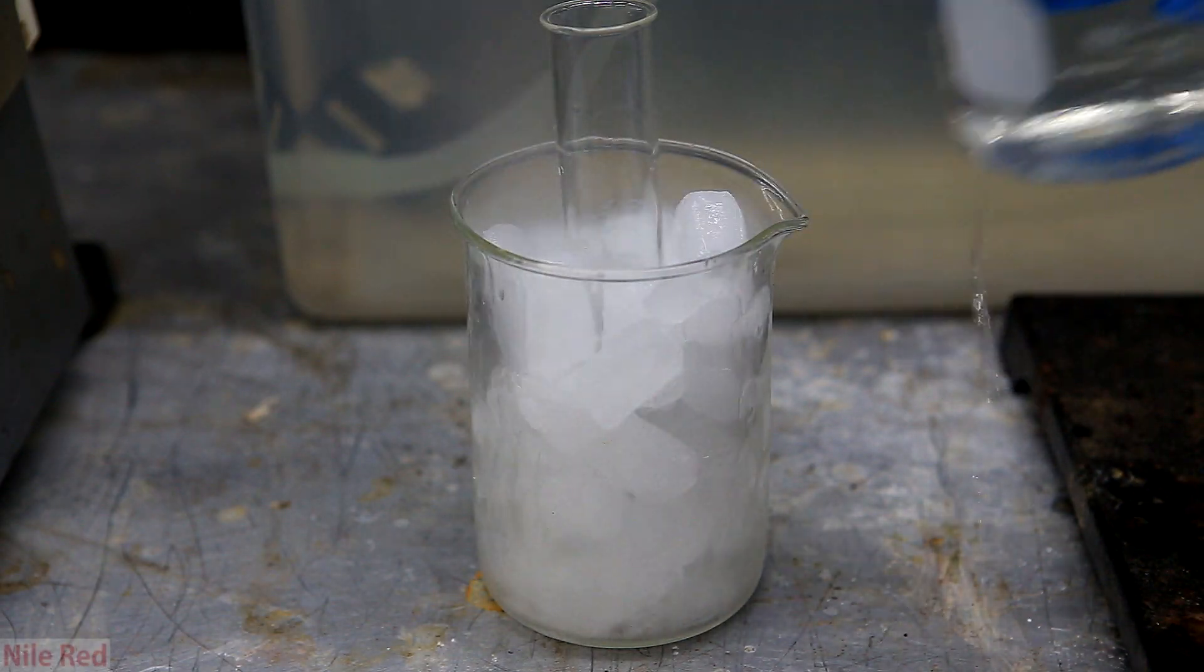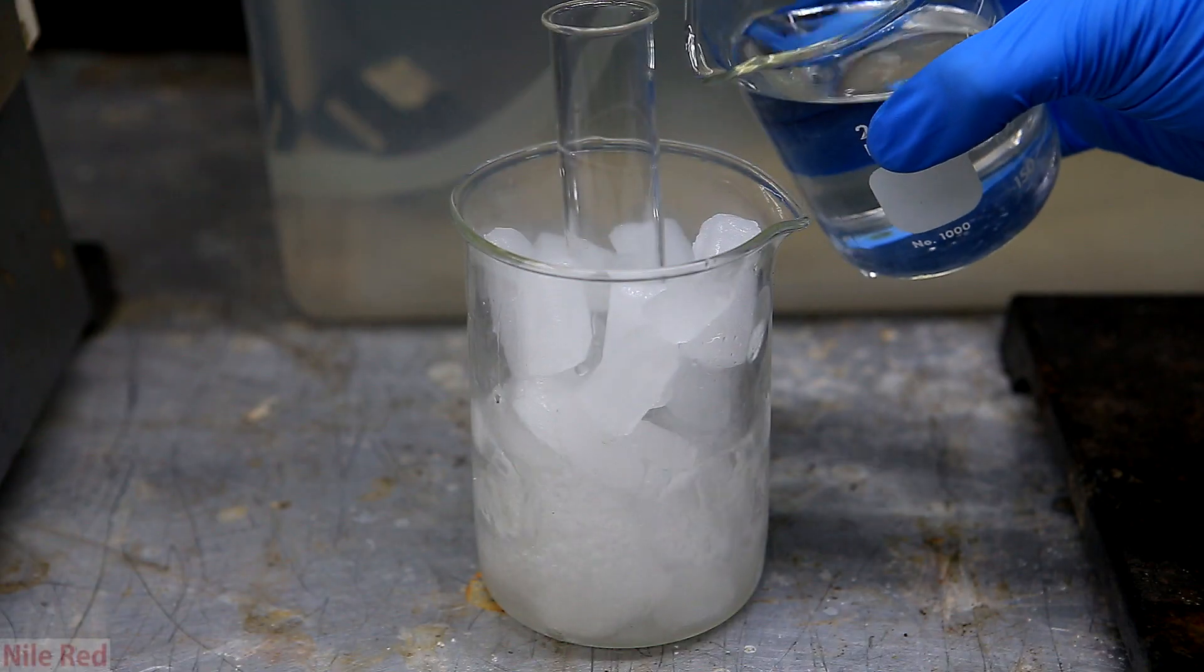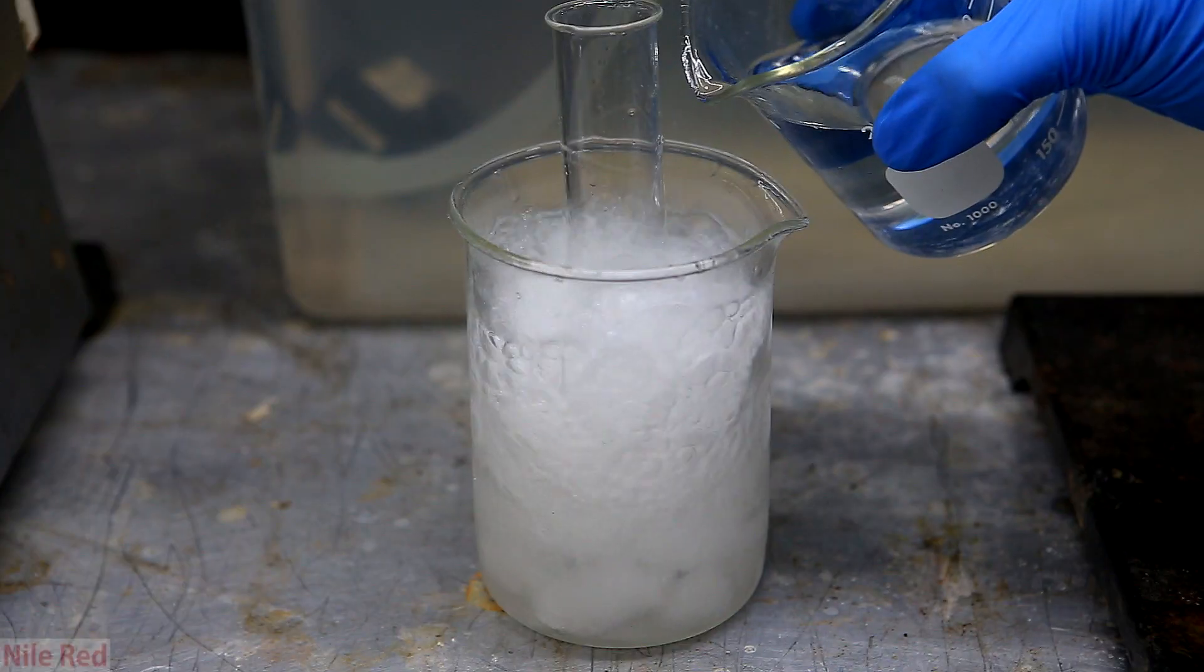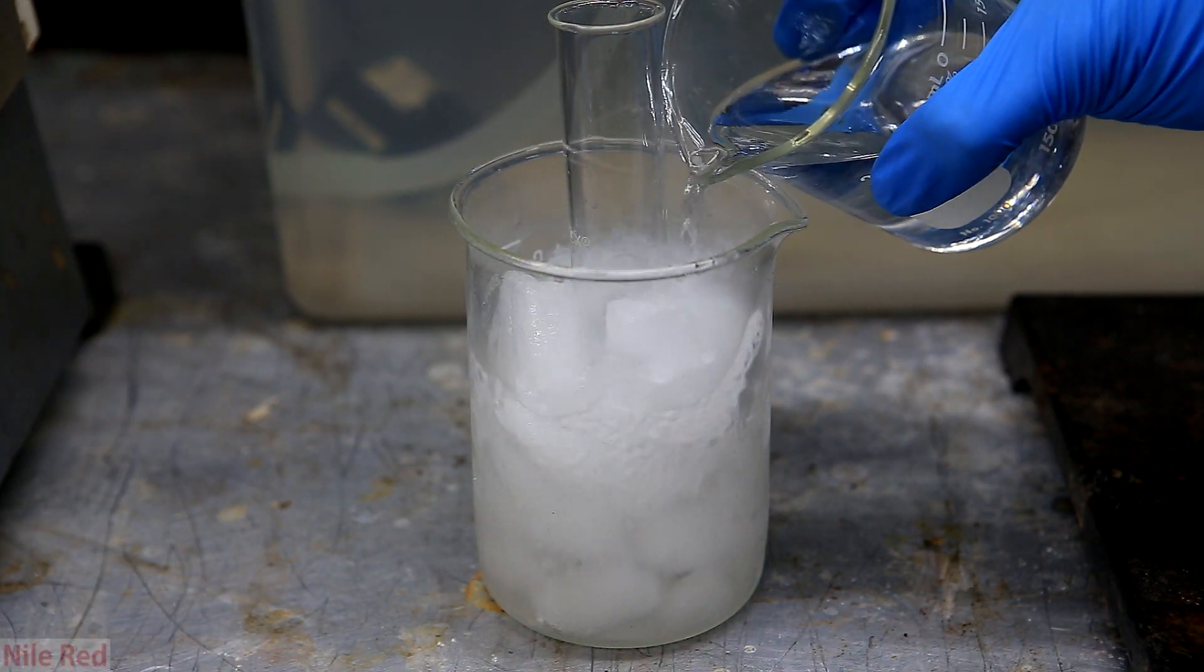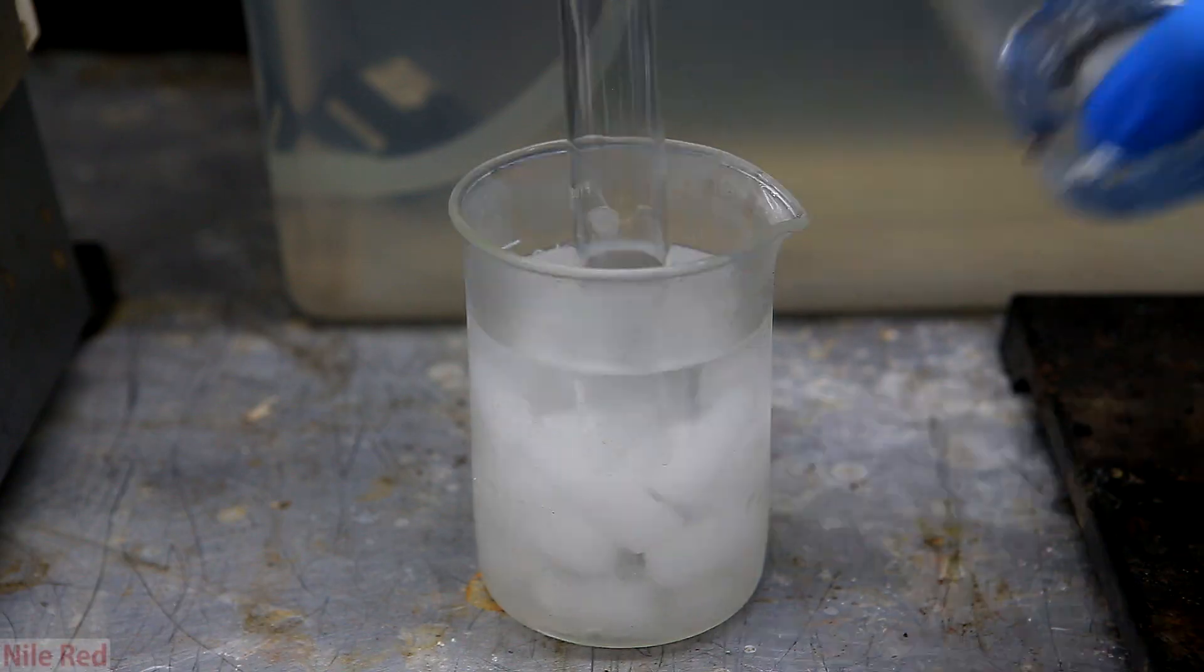The first thing we need to do is prepare something very cold to collect the ammonia in. To do this, I decide to submerge a test tube in a dry ice acetone bath. Dry ice has a temperature of about negative 78 degrees Celsius, and ammonia will start to condense at around negative 33.